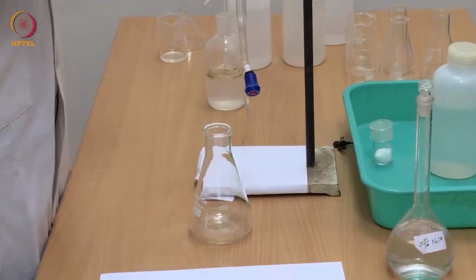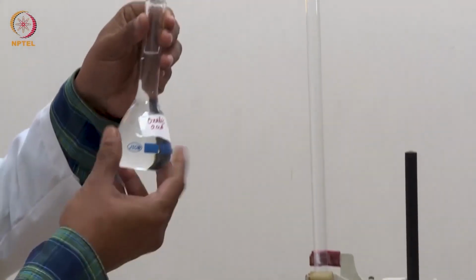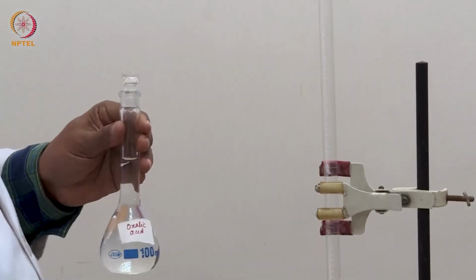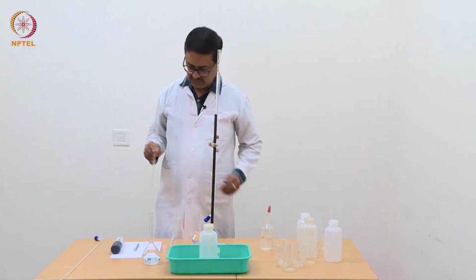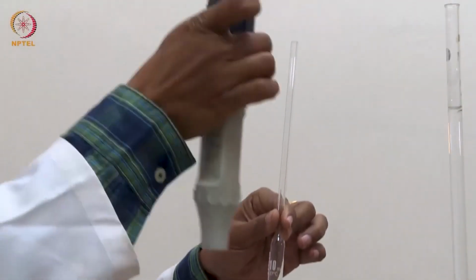Now I need to pipette out 10 ml of oxalic acid from this volumetric flask to this conical for standardization. So for that, I am going to use this 10 ml pipette and this pipette pump.